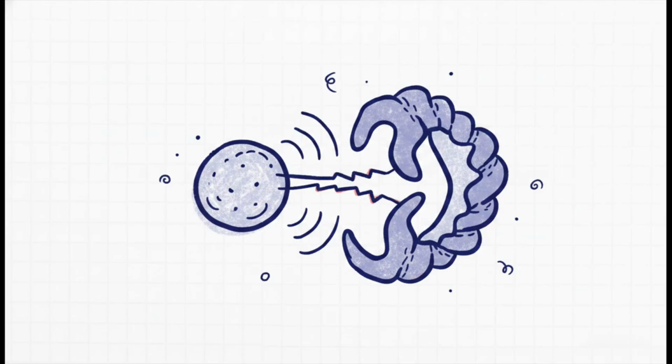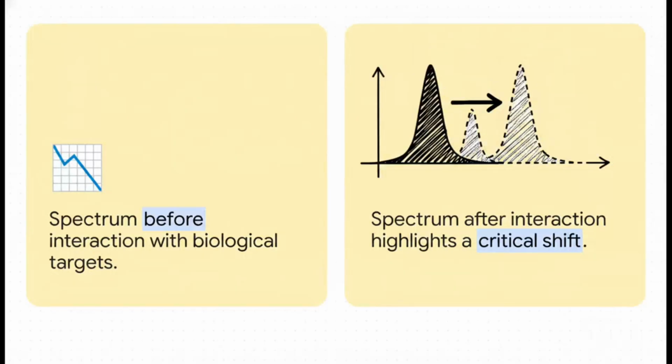This goes a step further than just proving attachment. It's all about dynamic, real-time interactions. When nanomaterials meet biological targets or polymers, they bind together. And FTIR is actually sensitive enough to monitor the structural shifts or the changes in vibrational frequencies as that binding happens in real time. The smoking gun here is all in the comparison.